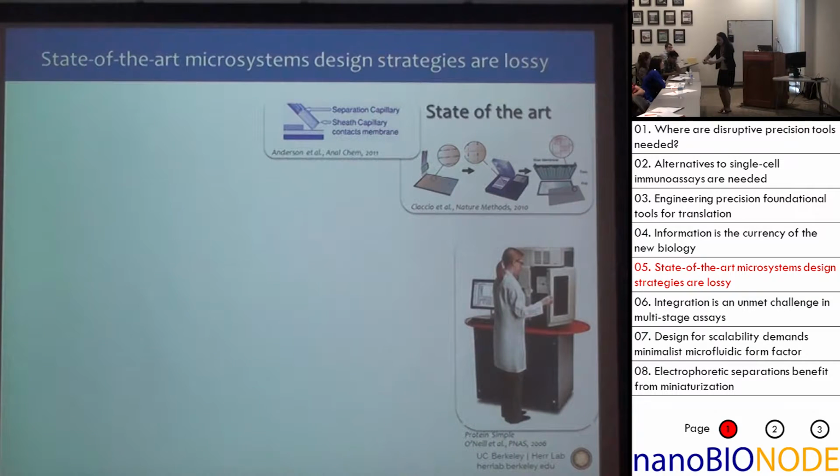Most people, these formats are really big gels. They use a nano printer to print little spots of different samples in the gel and then run electrophoresis. They do transfer material to different membranes and do imaging, so it's still kind of a cumbersome workflow, but really, really large numbers of samples.